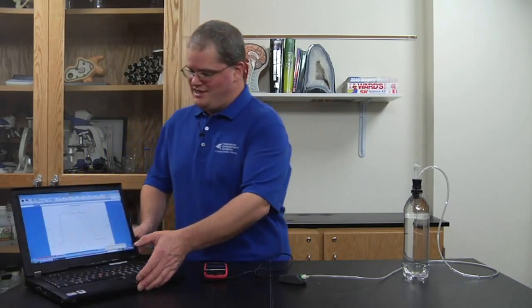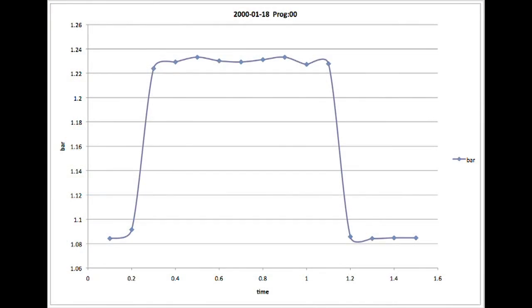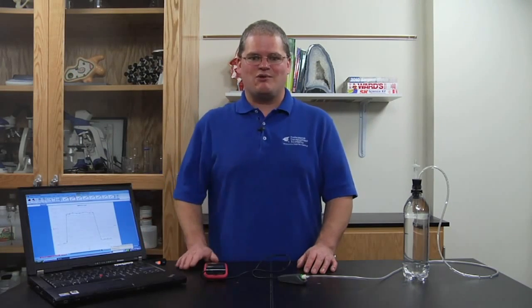And as you can see, we have a very easy graph. It's already come up. If you take the average of this range, that will give you your pressure necessary to maintain neutral buoyancy. Thank you for viewing this video about the red gas pressure probe.